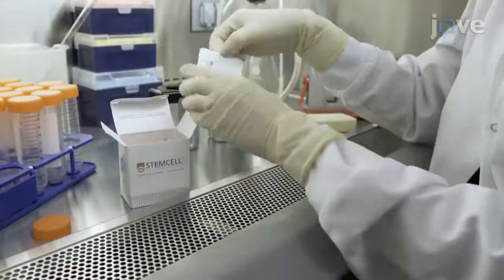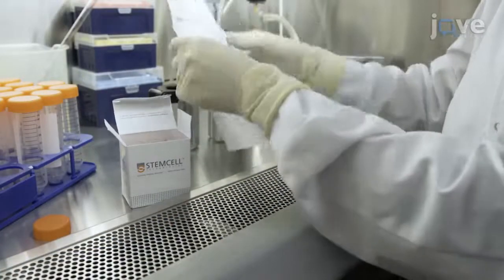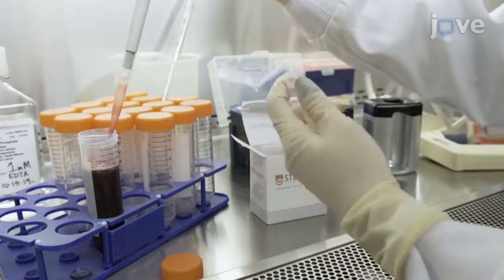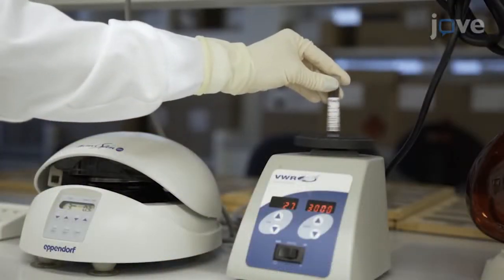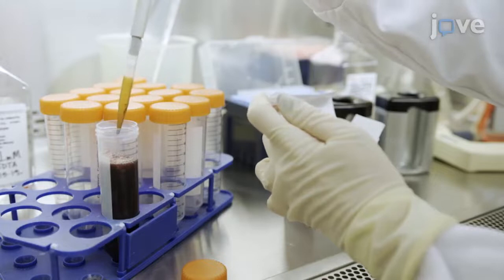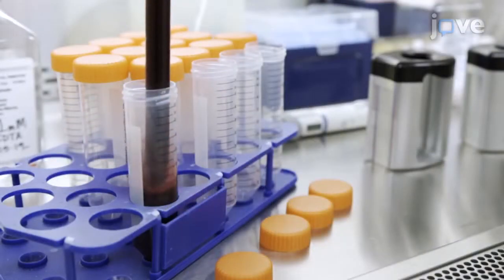Following the manufacturer's instructions from a selected human monocyte isolation kit, add 2 mL of monocyte isolation cocktail from the kit to the tube of blood and vortex the magnetic beads from the kit for 30 seconds. Add 2 mL of beads to the blood and use a 25 mL serological pipette to carefully mix the beads with the blood.